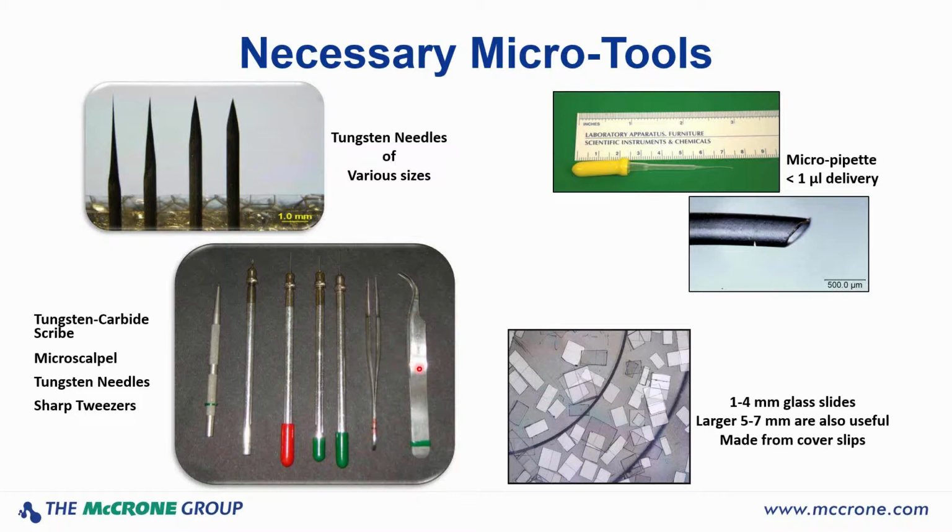That's D-U-M-O-N-T. They're very fragile. You drop them once and you throw them away. I generally buy them in multiples so that I've always got a good set of tweezers at hand.